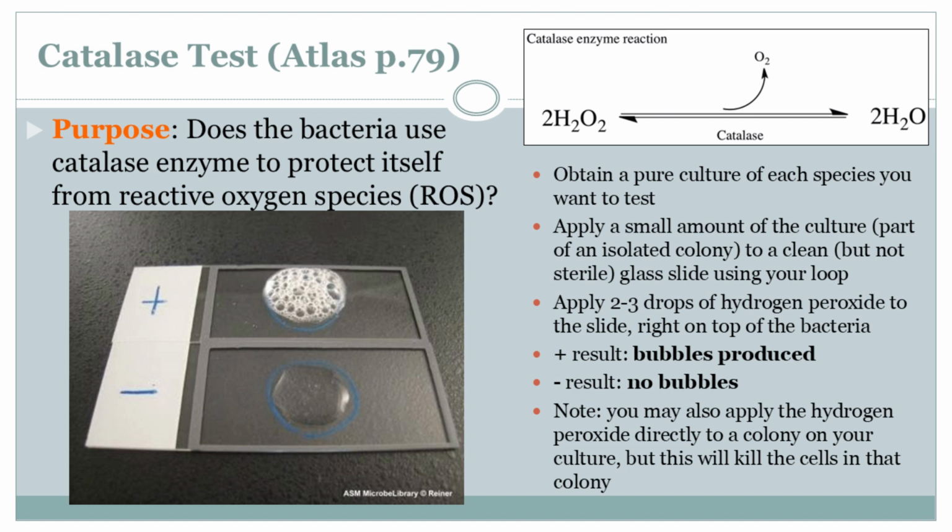So the Catalase Test is basically looking for those bubbles. Right. They add some hydrogen peroxide to a sample of bacteria and watch to see if it bubbles. That's it. Seems pretty simple for something that tells us so much about bacteria. It is simple. Elegant, even. But powerful. That's the beauty of it.